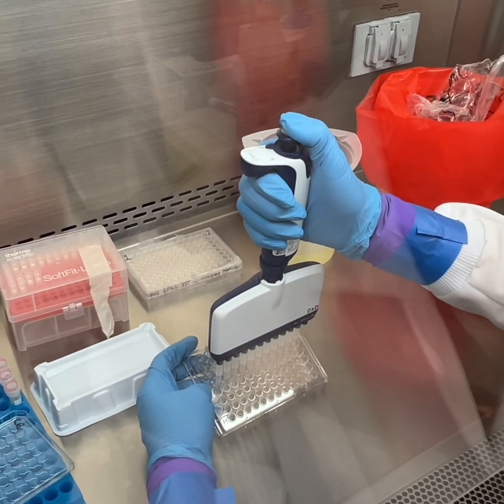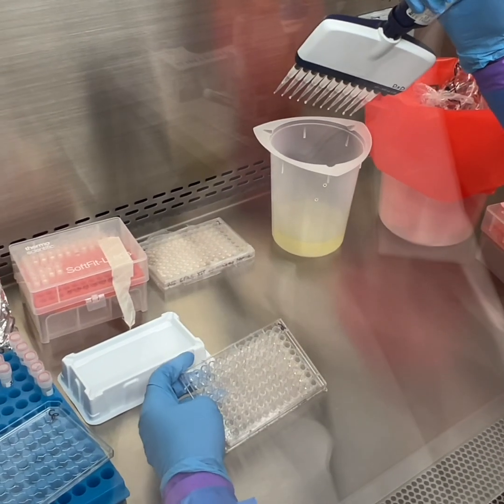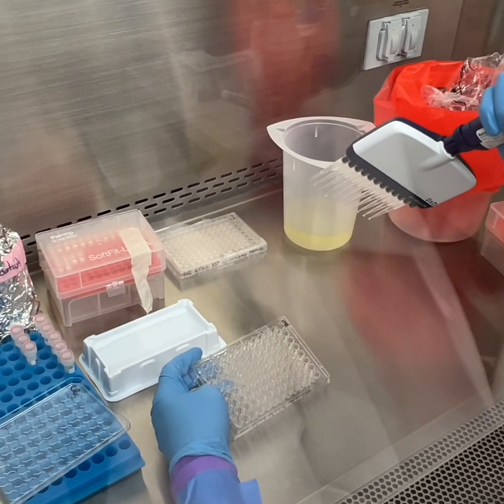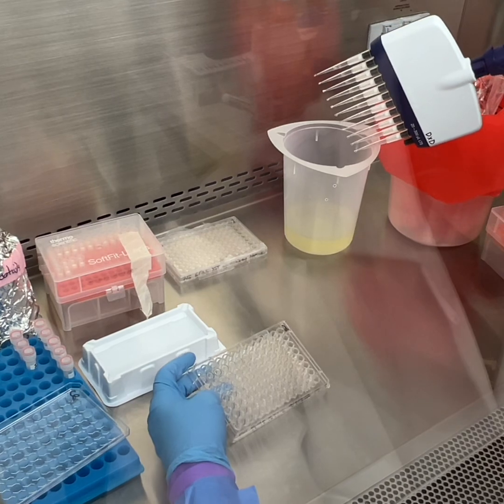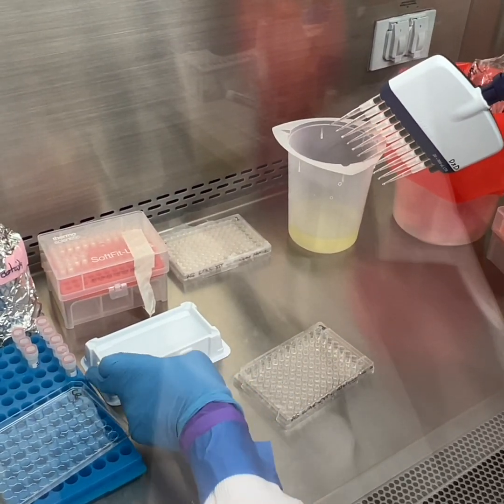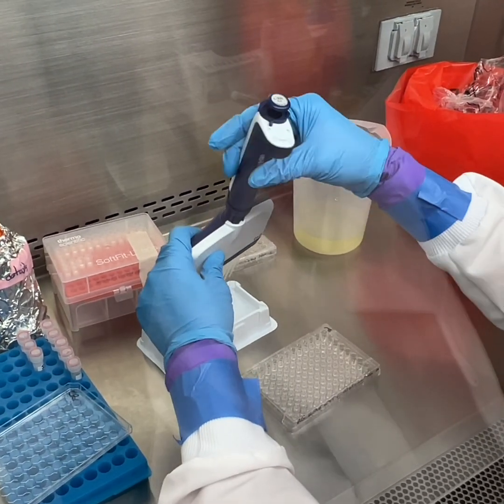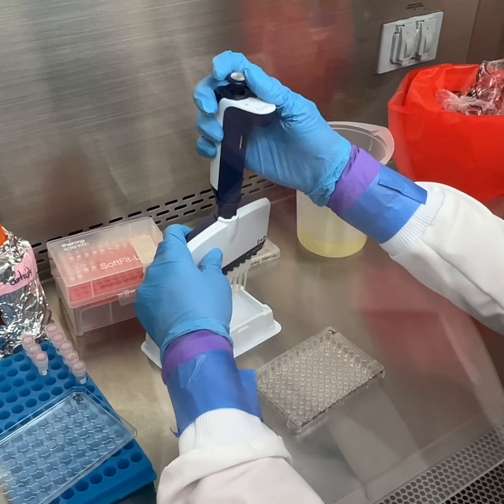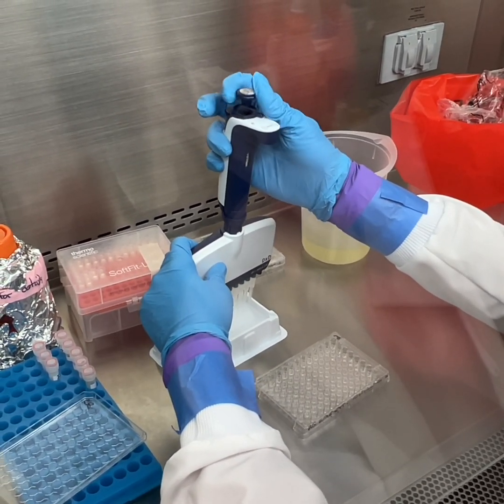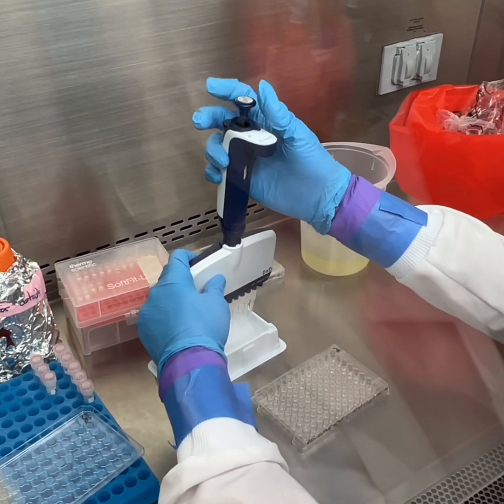Since this PBS is going to be in this plate and we're not reusing it, I'm just going to use the same pipette tips, but I'm going to change it to 300. It's at this point too that you should document if there's no visible biofilm in some of the wells.